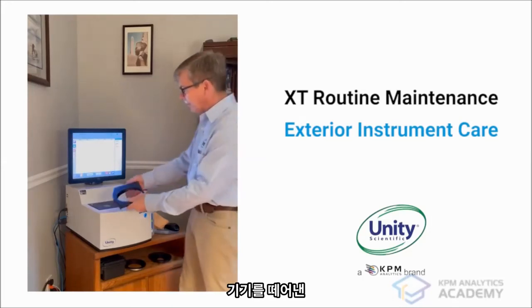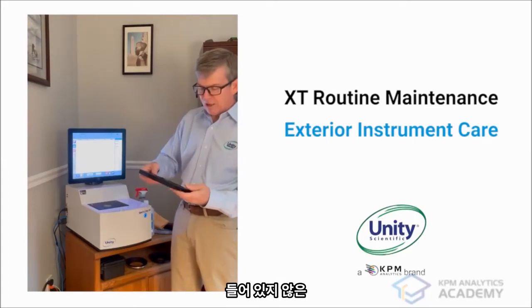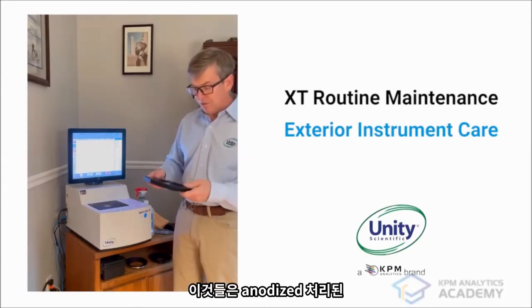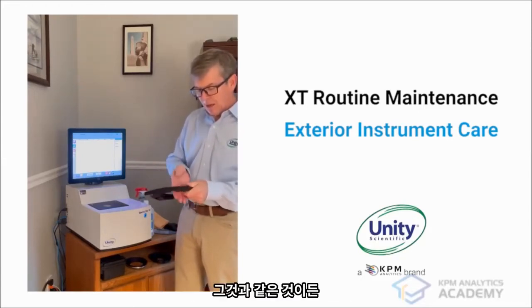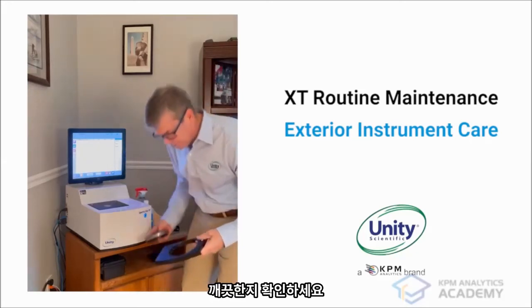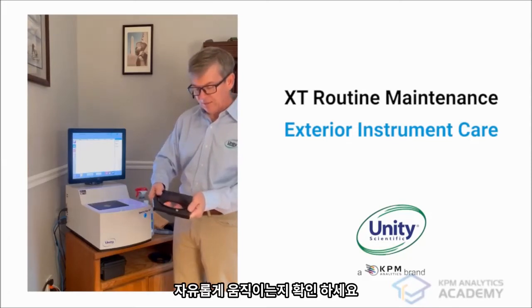As to the multi-cup adapter that I pulled off the instrument, take out the sample ring, disassemble it like I've done here, and just go in and make sure that all of the moving parts are clear, that you don't have samples stuck inside, that everything is freely moving. These are anodized aluminum. They're very strong. You can clean them if you need to with a paper towel and anything like a glass cleaner or something like that. But make sure that your sample presentation and your multi-cup adapter is clean, and also when you put in your sample ring, make sure that it is moving freely like this.